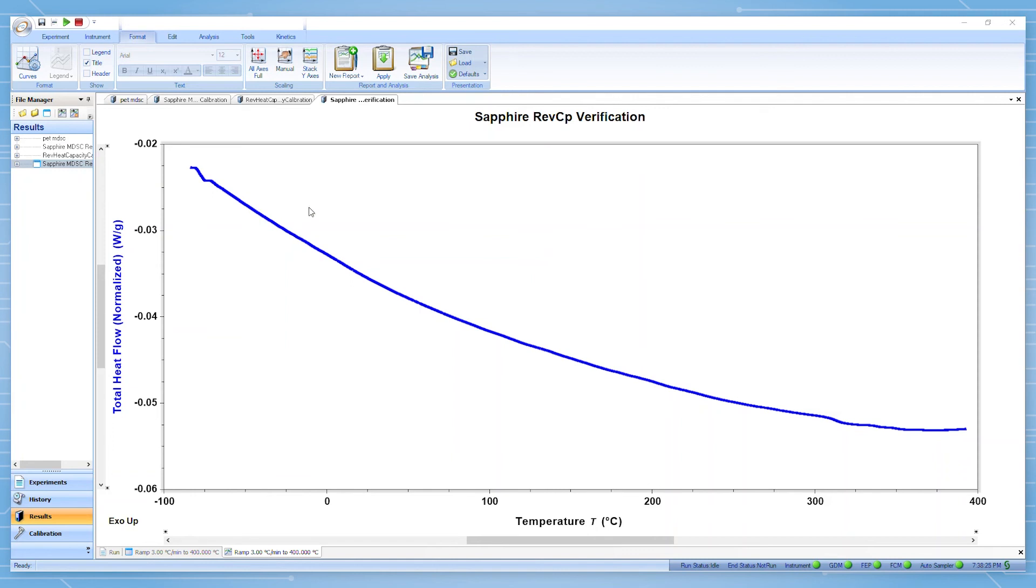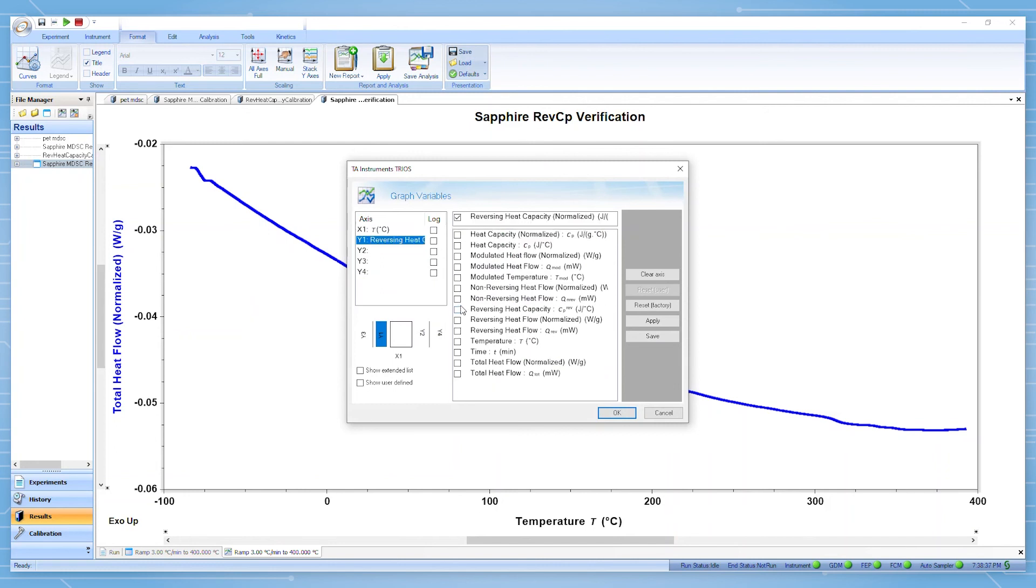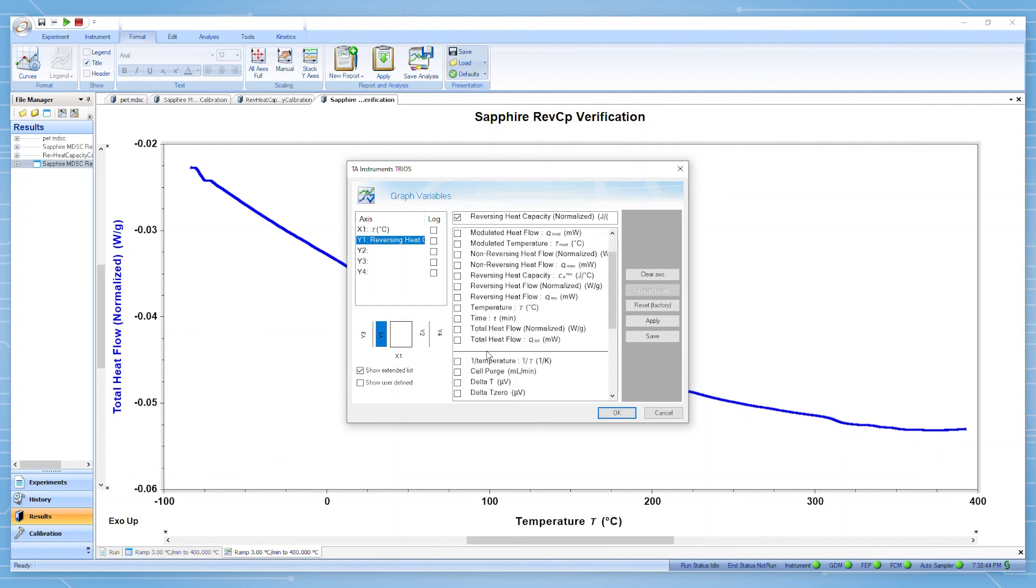You can double click on the graph to select your variables. Plot the normalized reversing heat capacity from your experimental run. In TRIOS, you can then also plot the literature values of the heat capacity of sapphire by selecting it from the extended list.